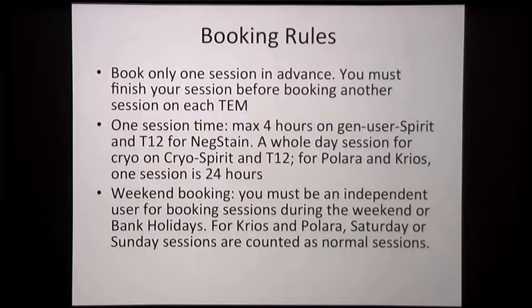And also, at that time only one or two or three people could use it, so it wouldn't count. But now I think more people can use Krios over the weekend, and then we count the EM session in the weekend as one session now. So I hope people are following this.